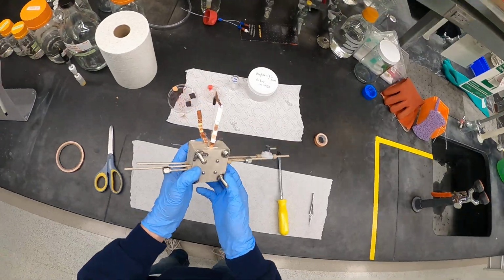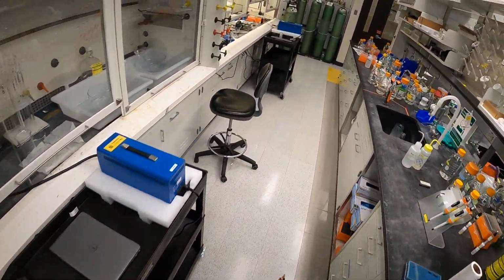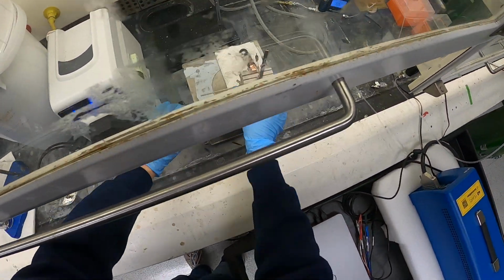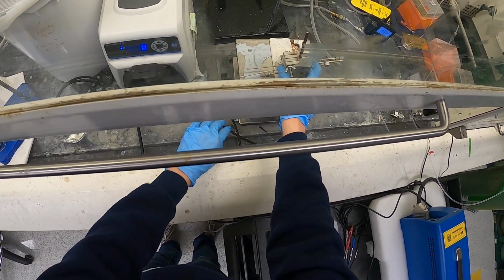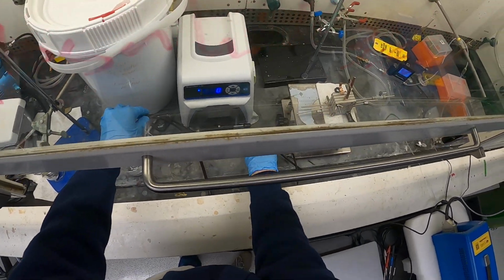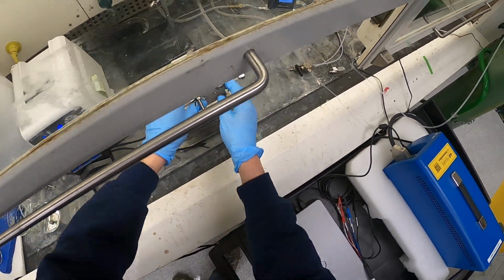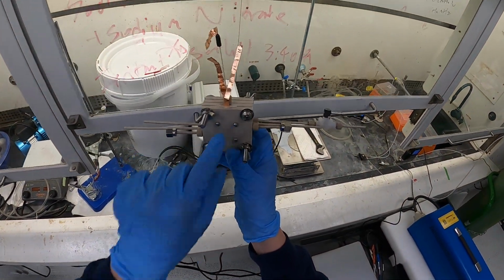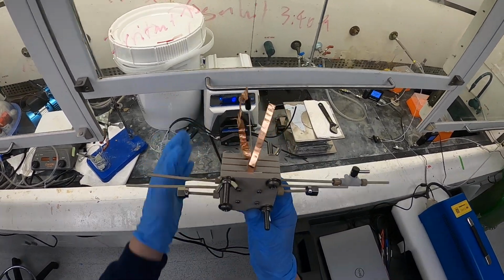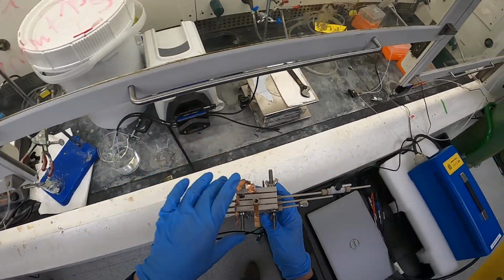Now what we'll do is take it over and hook it up to gases and liquid electrolyte. So I've got this kind of preset up where if you're using an electrolyte, you'd use it here. I just have water for now. But you'll put these tubes, hook them up to the peristaltic pump, load one into the far end, and you can see that these 4 screws are facing that way, meaning that we assembled the cell on this side and built it up that way. So this side is our working electrode with this copper tape, and this side is our counter electrode.